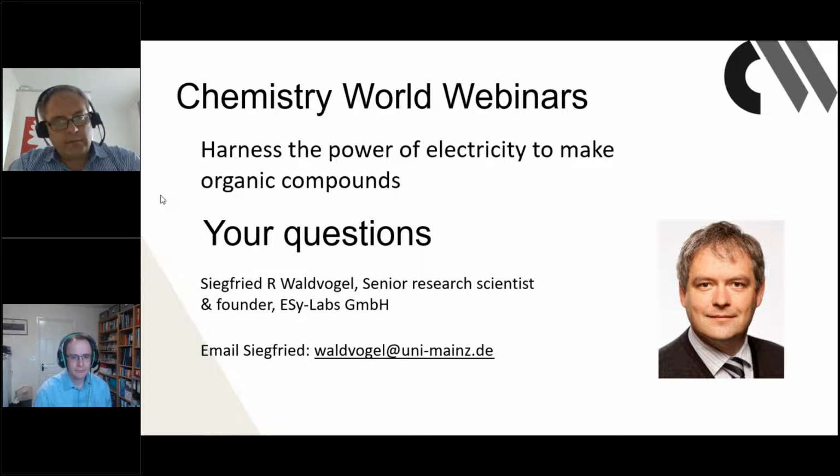Let's come to the second part of the question from Mikhail. Stirring of the reaction, you would anticipate it's very important for the mass transport, but keep in mind that the last micron in front of the electrode is almost not affected by stirring, even if you have very strong stirring, because you have salts in there and they just glue a little bit. The closer you come to the electrode, it becomes more and more sticky, a swamp, let's call it like this.